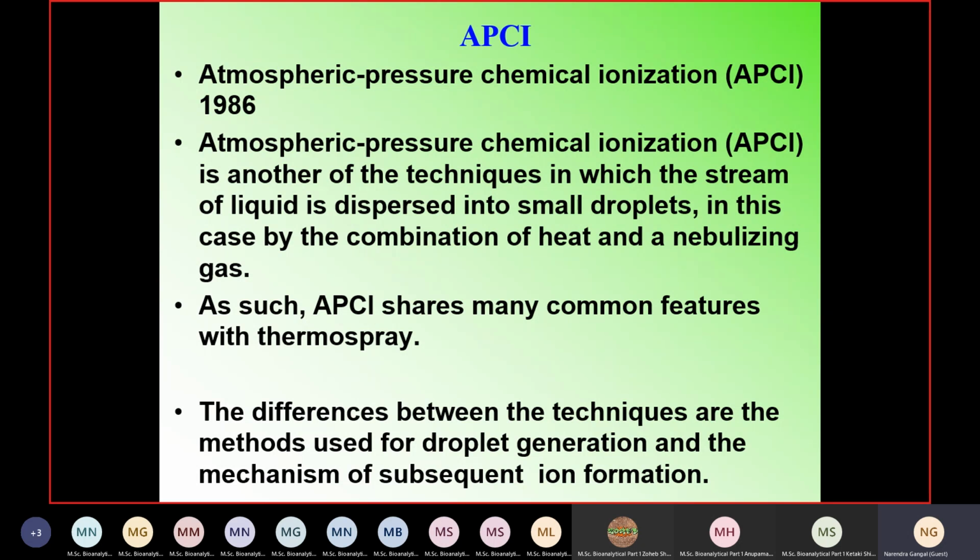Now when I talk about LCMS, I have a large quantity of solvent, and I have my solute of interest dissolved in it. Then it is injected through my injection portion, a Rheodyne or maybe an auto injector, and subsequently passes through my column, carried forward continuously by the solvent under pressure, and it separates all my species into various peaks.